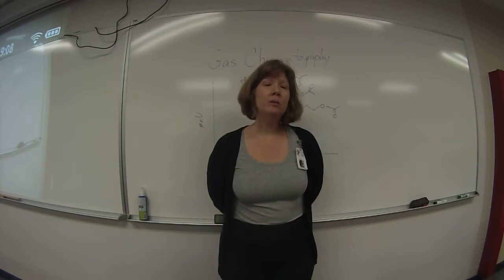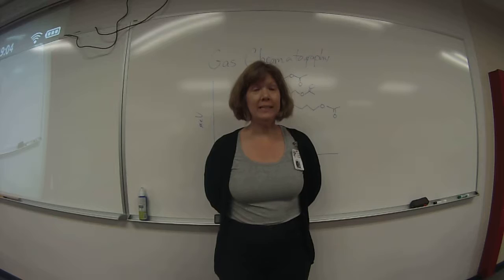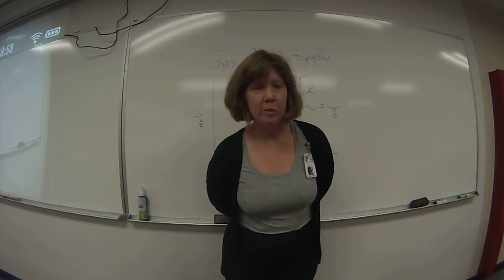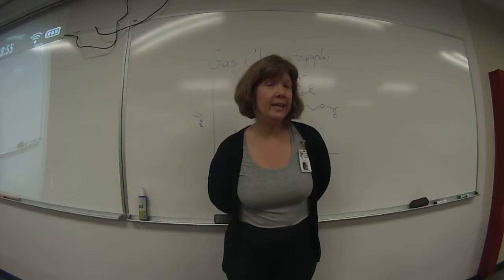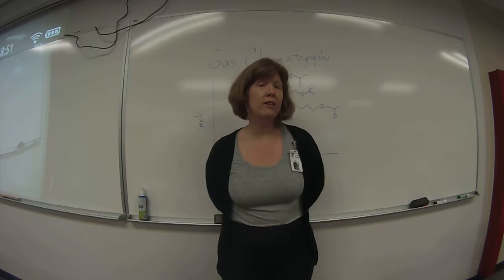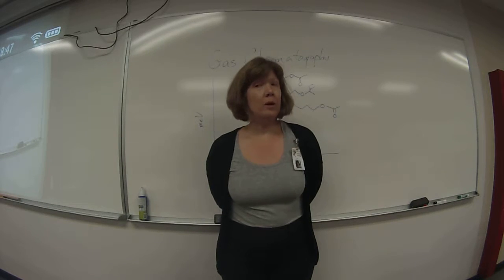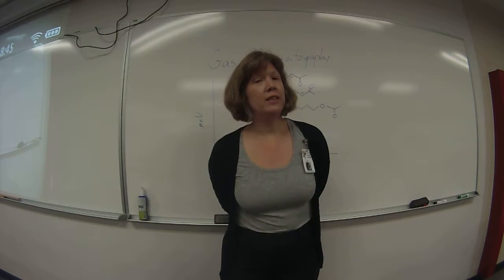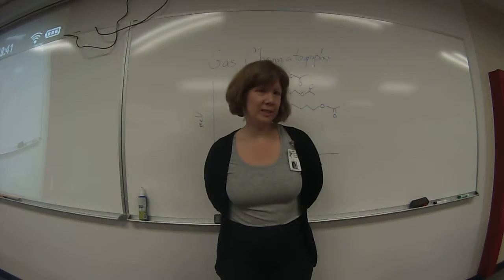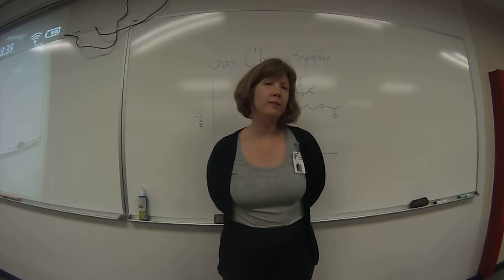Today I'm going to tell you about the experiment that we're doing on Wednesday, which is a gas chromatography experiment. You'll be studying a mixture of ethyl acetate, propyl acetate, and butyl acetate. You'll use first an equimolar mixture of these three compounds, and you'll put about a microliter of the mixture into a syringe, then inject the mixture into the gas chromatography machine.